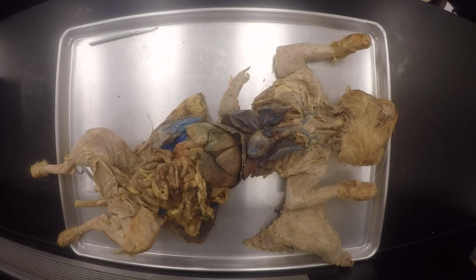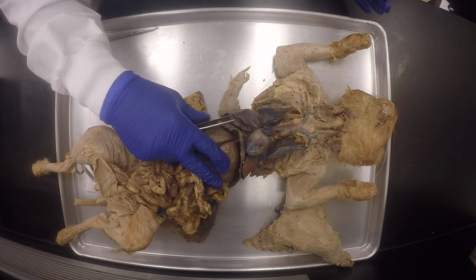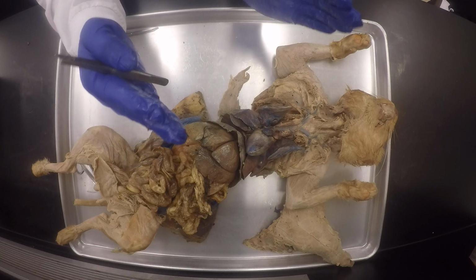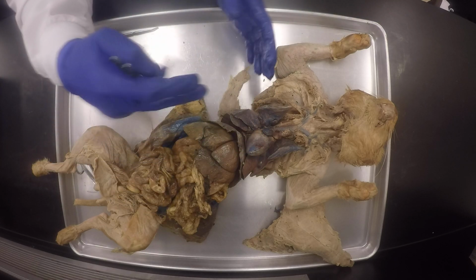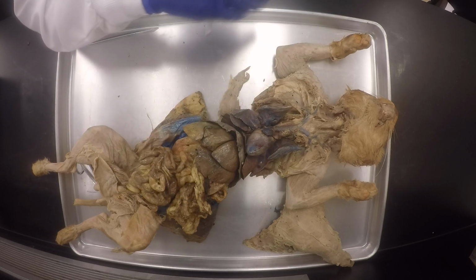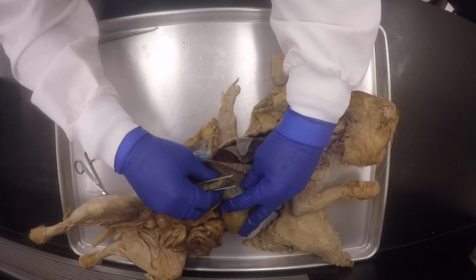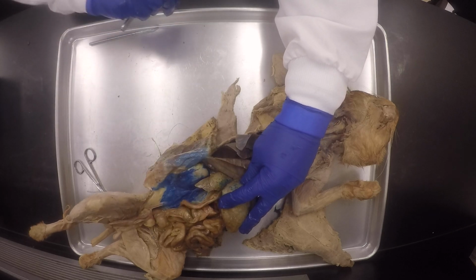See, because the liver is on the right side, it looks like it's in the middle here, but that's because the cat is narrow. You see what I'm saying? So it looks like it's in the middle, but it's not. It's really on the right side. This is why you have to go all the way to see the right lateral lobe. You see what I'm saying?